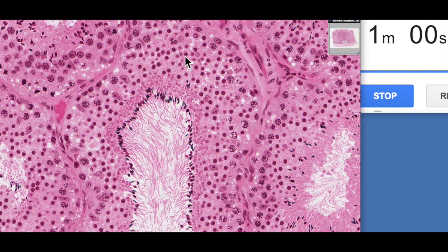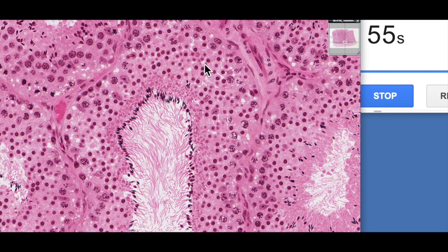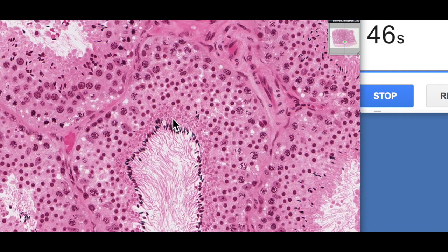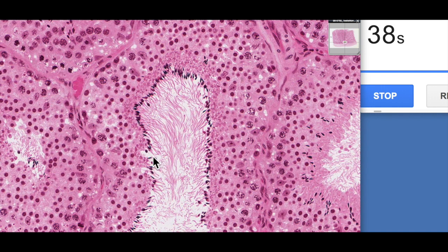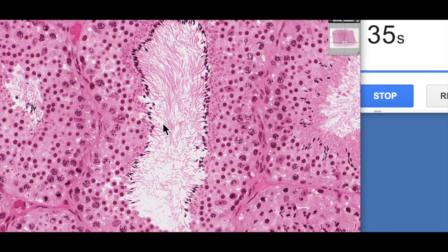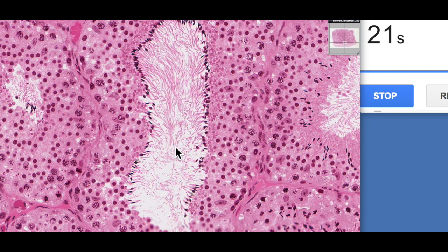These round nuclei are the spermatids. They then undergo a morphological change known as spermiogenesis, where they transform from these round cells into the mature spermatozoon shape — you can actually see them here, with their tails all projecting down into the lumen. Eventually they're released in a process called spermiation, and through contractions of the myoid cells in the wall of the seminiferous tubule, within the testicular fluid, they're pushed through via the straight tubules, the rete testis, and into the rest of the male reproductive system.